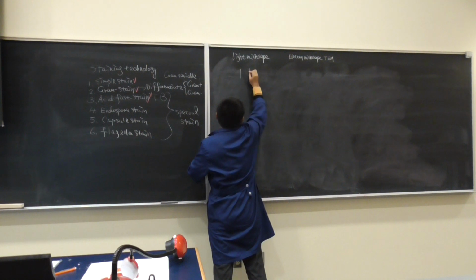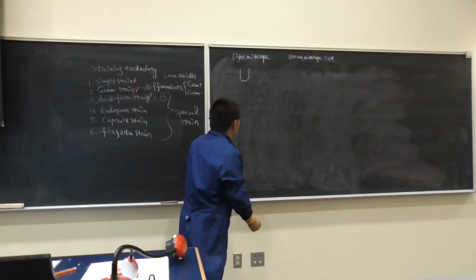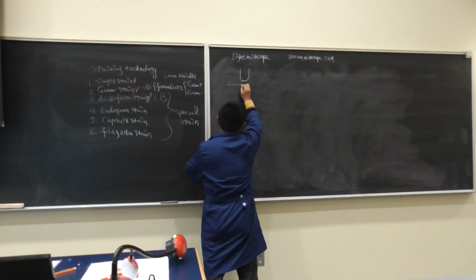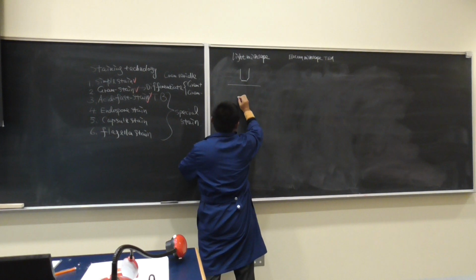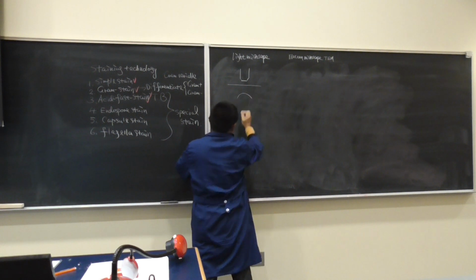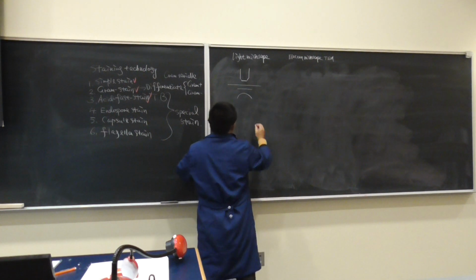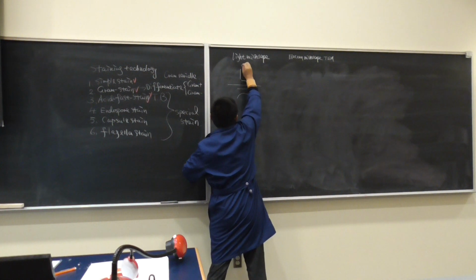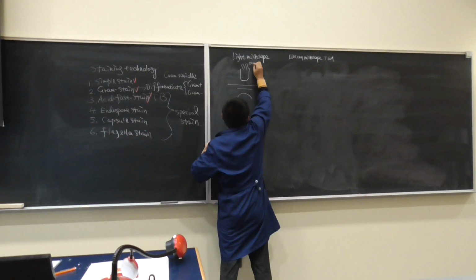We have a lens, that's not a problem. Objective lens. Then we have a stage. So you have a light source right here. That's a light. You have a condenser. And on the top, you have two things coming up here, the ocular lens. Okay, so we draw the ocular lens.